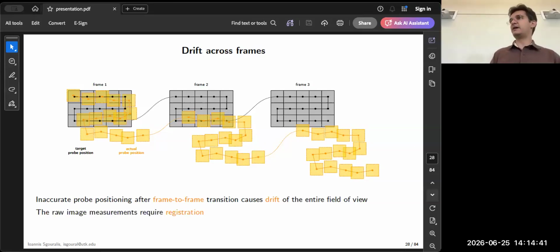Now, the good thing here is that typically when we have drift, which means we have successive images that are just translated relative to the previous image, the mathematical or computational methodology that we need to follow requires basically some type of image registration or variants of image registration. And the good thing is that image registration is a relatively cheap procedure to do, which means that as long as we want to just correct drift throughout while the microscope is operating in real time, there is actually a lot of hope because fundamentally the computations that might be involved are not that dramatic.